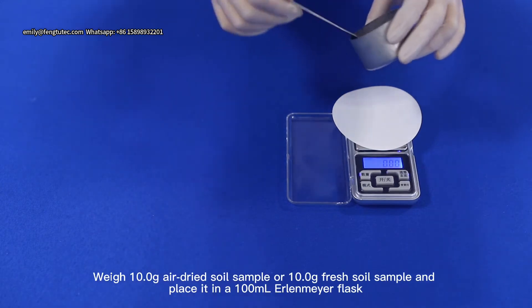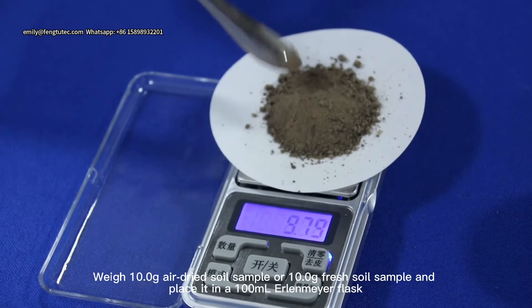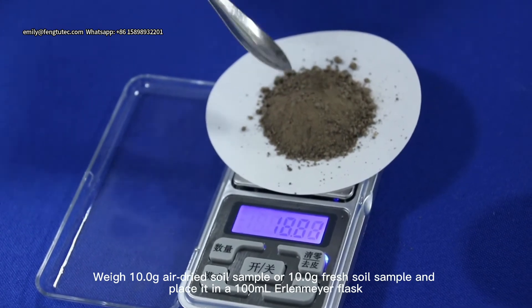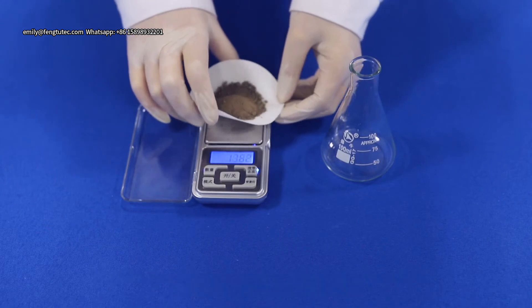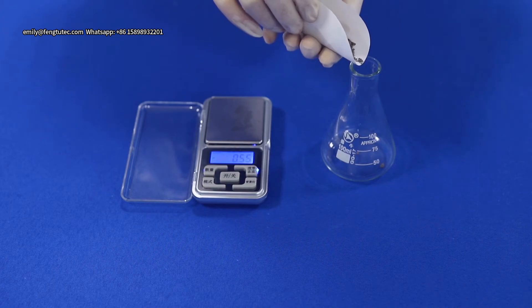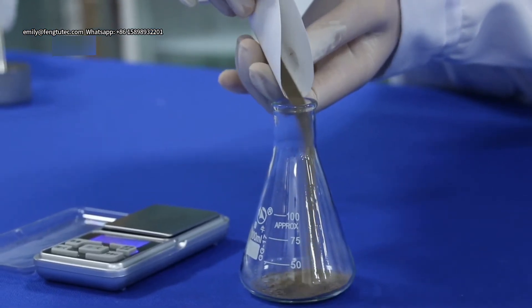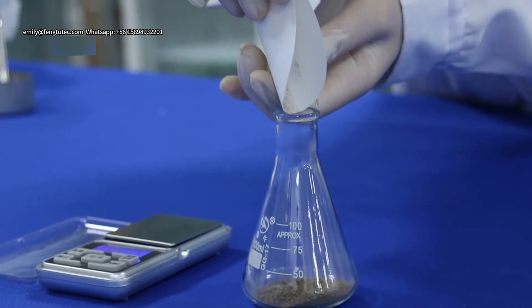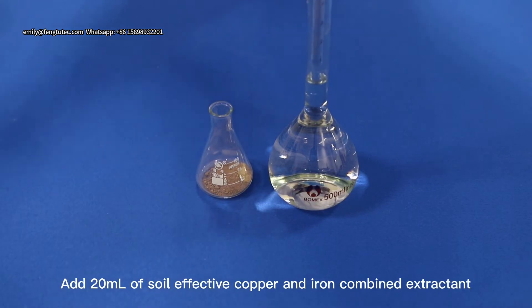Weigh 10.0g air-dried soil sample and place it in a 100ml conical flask. Add 20ml of Soy Leaf Active Copper and Iron Combined Extractant.